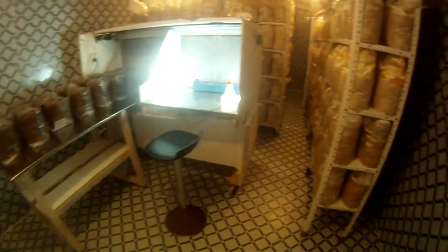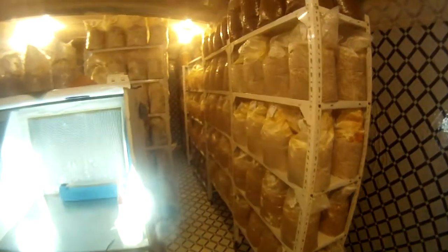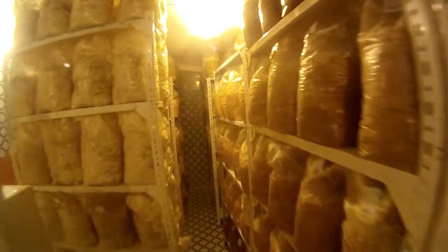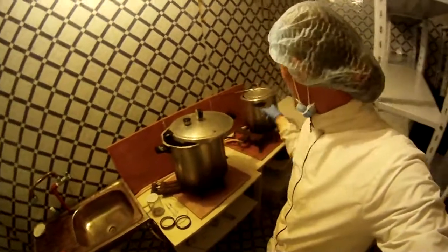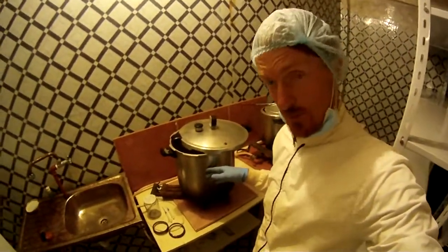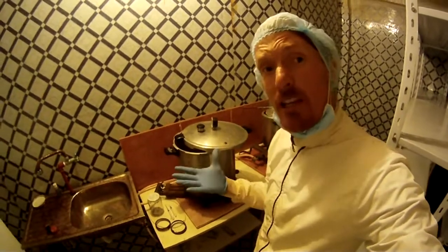You see all my empty shelves - I like to have them full of spawn. I've got my lab fridge here where my test tubes stay. That is pure mycelium, isolated mycelium. Fungus can keep in a fridge for five years. I pull that test tube out and I've got my small pressure cookers - two of them - where I pressure cook the agar medium.